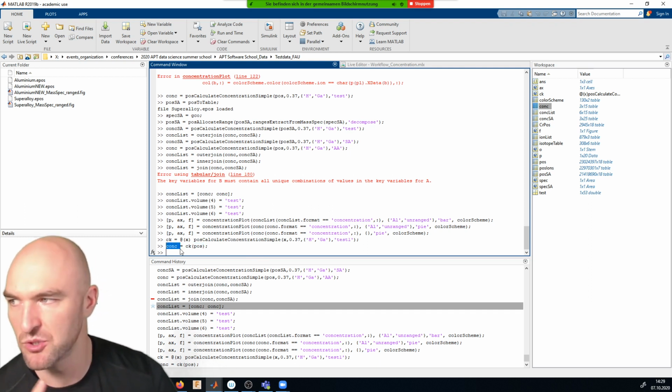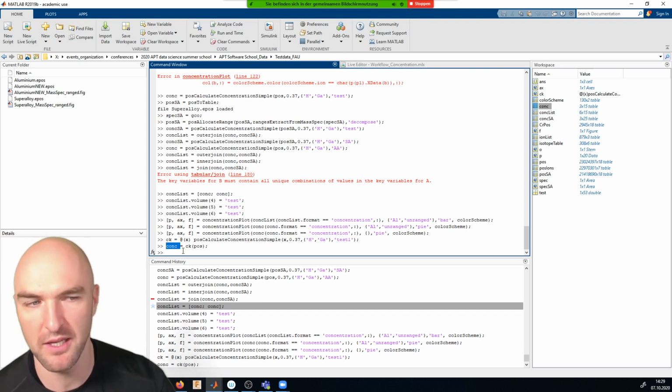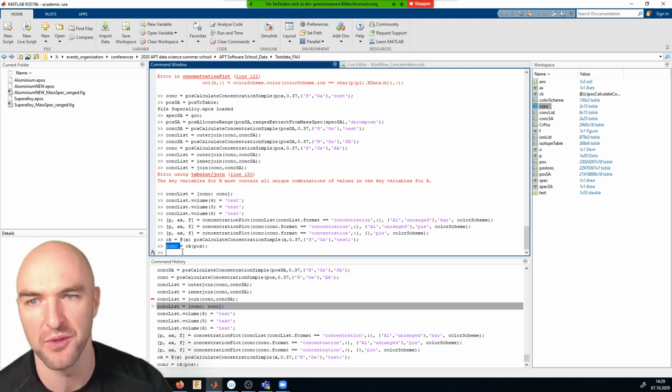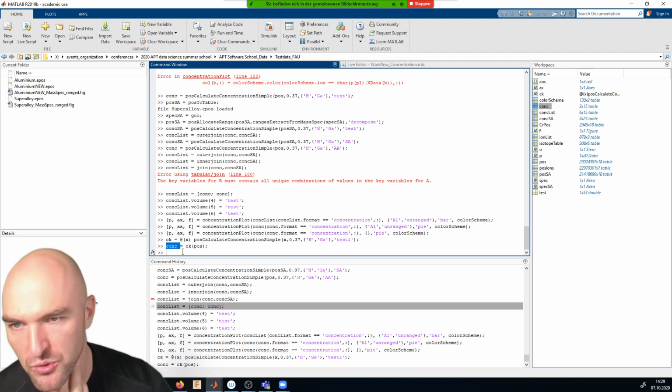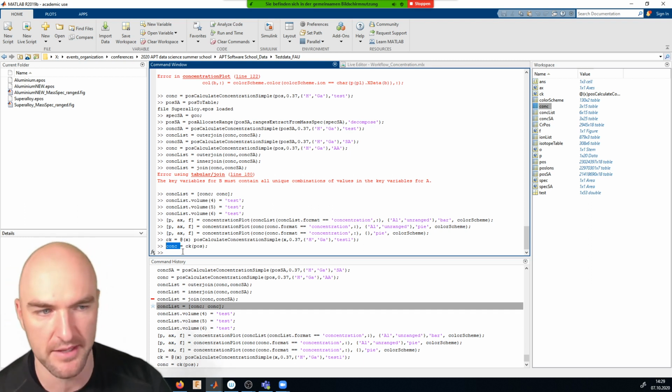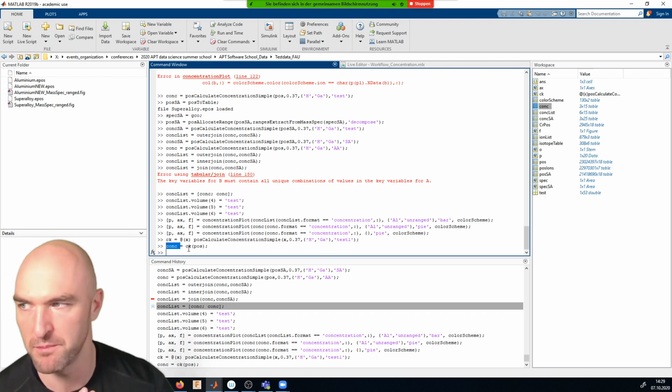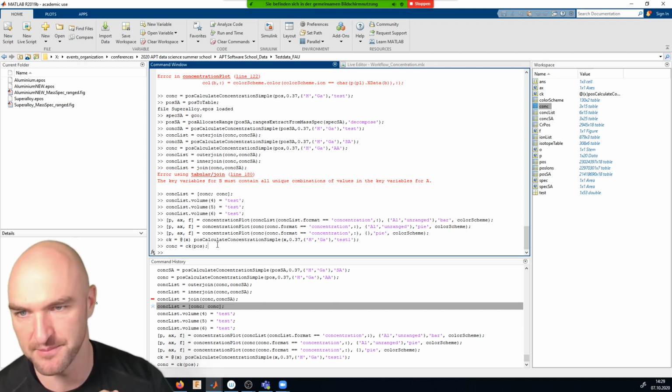As long as you write your concentration function that way, you can then create this anonymous function, this function handle, such that it only takes pos as an input and outputs a concentration. And you can plug it into any of our 1D, 2D, and 3D analysis programs, and it will perform the concentration calculation according to how you wrote the calculation concentration program. So you can, for example, make use of isotopic abundances. You can make use of any information that you can think of, and it will still work with all of our downstream programs. We will actually go a little bit deeper into that when we look at ND analysis.